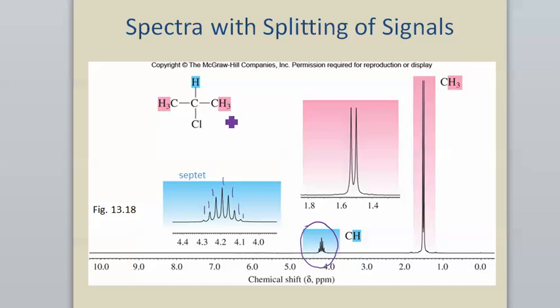In the meantime, those pink hydrogens here, the ones that are highlighted that way, the 6 hydrogens, this is a doublet. Sometimes you see a little D for doublet. And again, very close together, kind of hard to see, so that is expanded here. I guess you can see the doublet more clearly in that expansion. And that doublet is because that signal is being split by a single neighboring hydrogen.